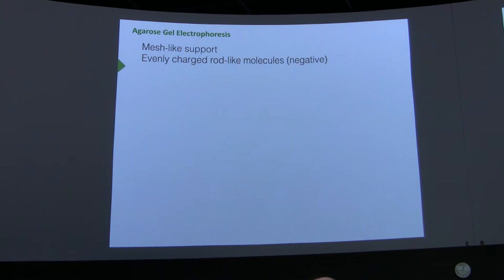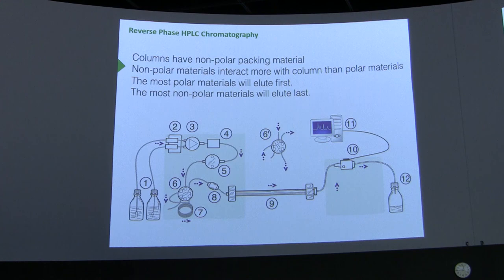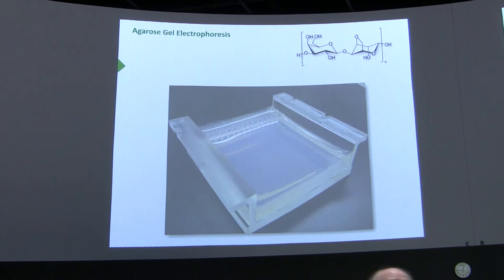Electrophoresis is typically done on very large molecules. Agarose gel electrophoresis is done almost exclusively on either DNA or RNA. The largest biomolecules in cells by a long ways are the nucleic acids. Way bigger than proteins. Way, way bigger than proteins. Okay? Now, so we have a mixture. We have that gel back there. We load the sample in those wells, as you all have undoubtedly done.